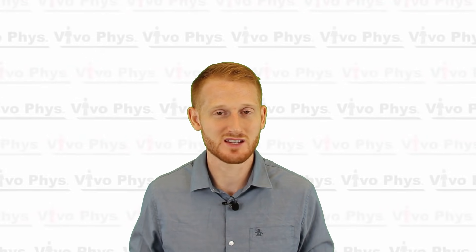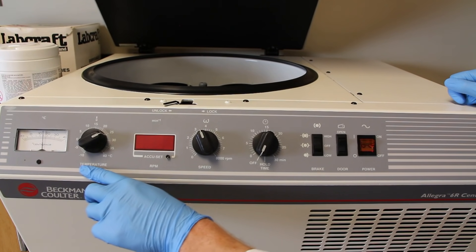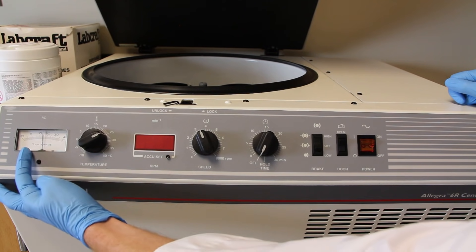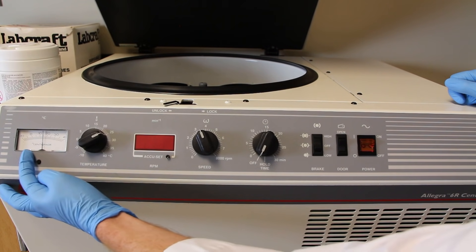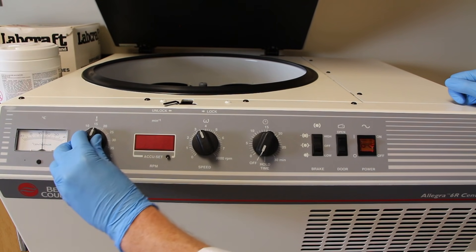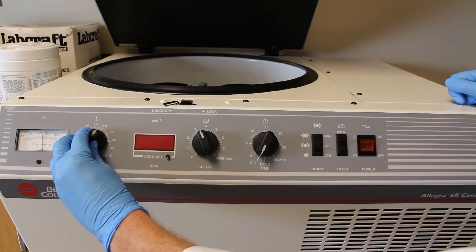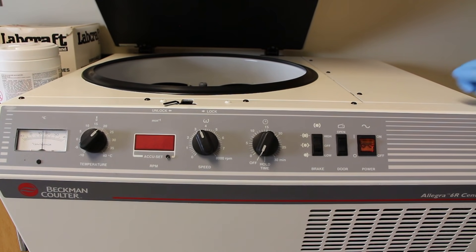Once you have confirmed that your coagulated blood or the blood that you want to coagulate has coagulated, then you can take the blood samples and you can put it in a centrifuge. Centrifuges can be set to several different parameters. You can set the temperature of the centrifuge. You can make it room temperature, which is approximately what I'm going to be setting it at, or you can make it cold, which oftentimes needs to be done if you're running a sample for hormones or something that's going to degrade quickly at room temperature.